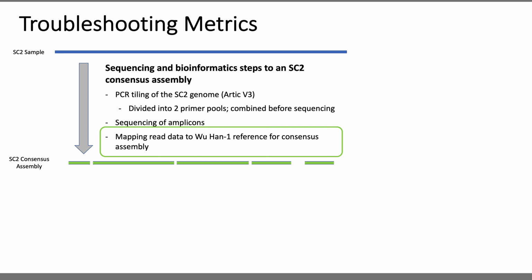So in thinking about this process, I think it will be helpful to have a bit of a visualization, and big thanks to Lee Katz for making the first iteration of this little animation that I've over the years modified and changed to fit different training workshops. Okay, so in this animation, imagine that you have a reference genome here in blue, and then with sequencing you generate your read data here in gray.